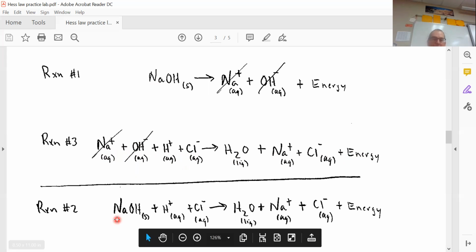Now, the last reaction is really a combination of the two things. But in this one, in the lab part, I actually take solid sodium hydroxide and then add that, instead of directly to water, directly to the 1 molar hydrochloric acid. So what happens is the NaOH first dissolves in this aqueous part here, and then the NaOH combines with the HCl. So it's almost like you have this first and second component both happening here. And because of that, I'd expect this energy to be bigger.